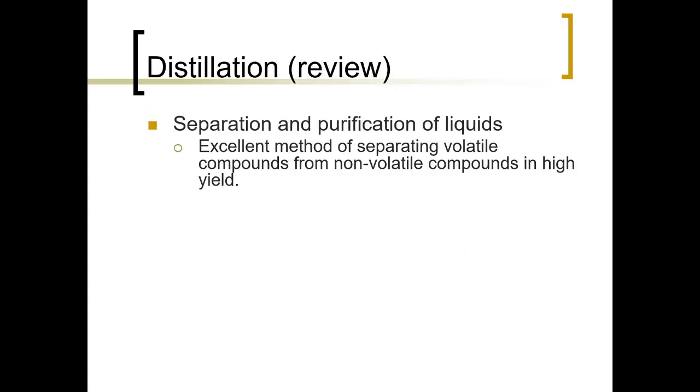You've seen distillation before. Distillation is a separation technique. We could also use it as a purification technique. Separation and purification do not mean the same thing. Separation, we can separate things apart, but that doesn't mean that they're pure. In this case, we're using it as a separation. We're separating it away from the carbohydrates, etc., that are in the cloves. But we'll later do a purification.